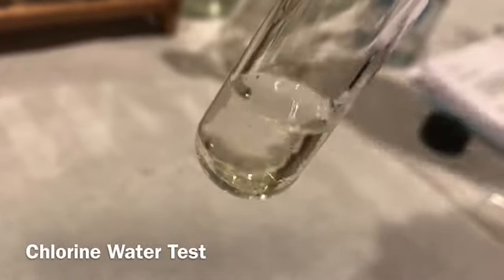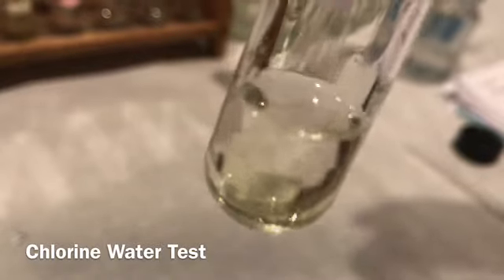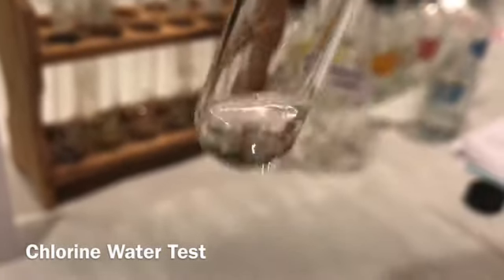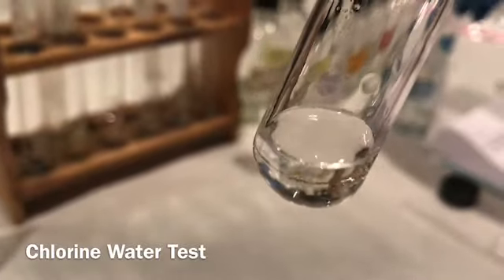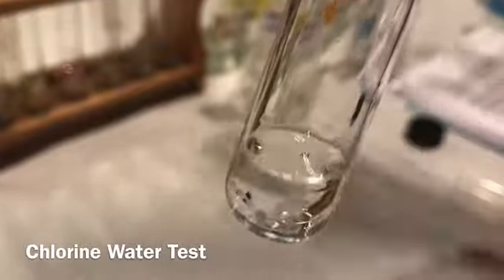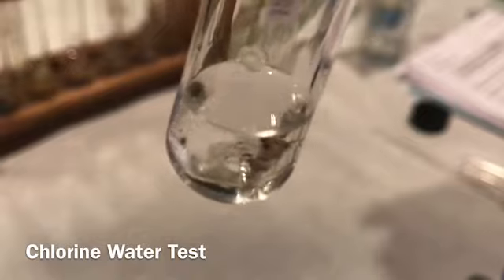So I am adding hexane in order to increase the volume of the upper layer. And this is the unknown number 1. Let me add the hexane to this as well.